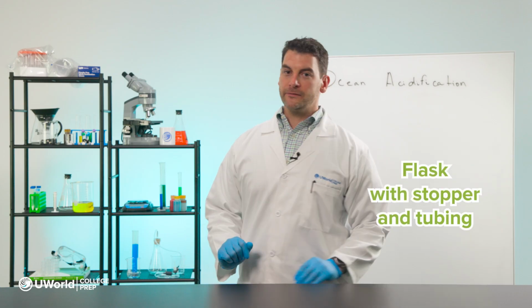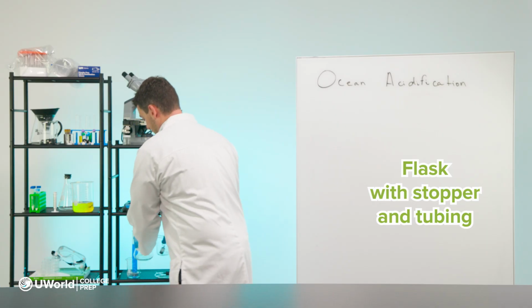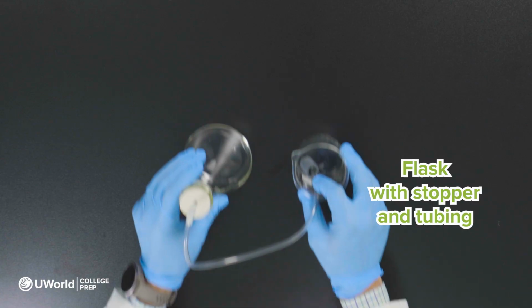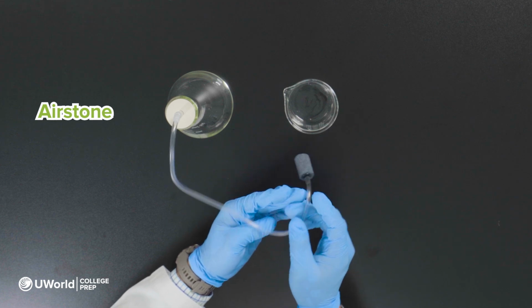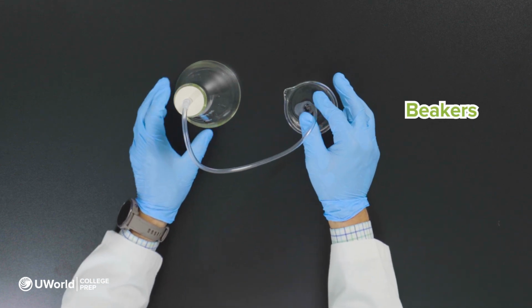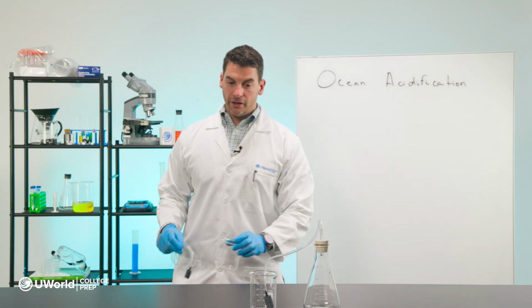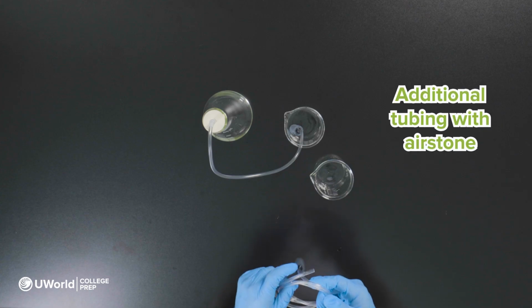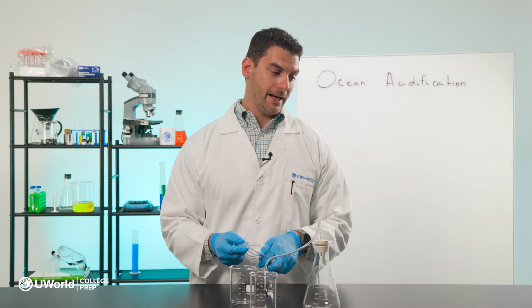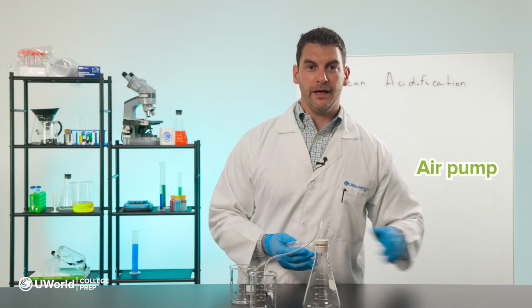So here's what we'll need to do this experiment. We'll need some flasks with stopper and tubing. On this, I've set it up so we have an air stone on the end of it, and that'll become important in a second. We need a couple beakers. I have one here, and I have another one here, and then I have some more tubing with another air stone. This tubing is going to get connected to our air pump that we already have plugged in and ready to go.